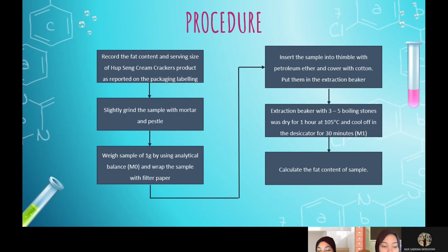After 30 minutes, we weigh the sample and calculate the fat content of the sample.